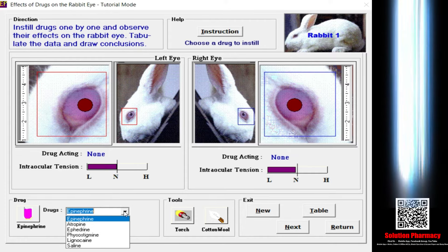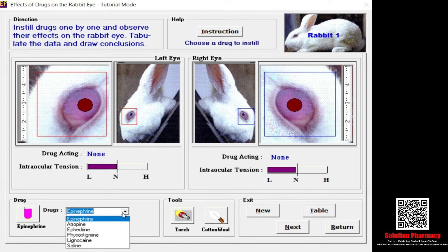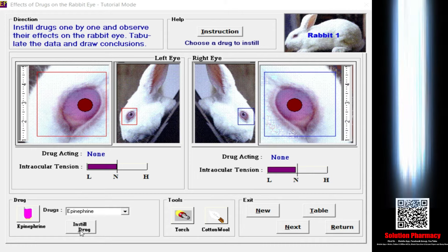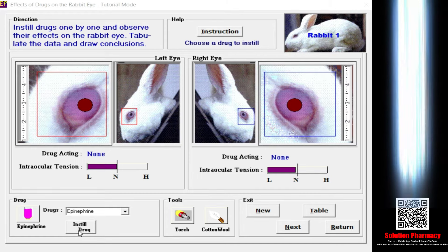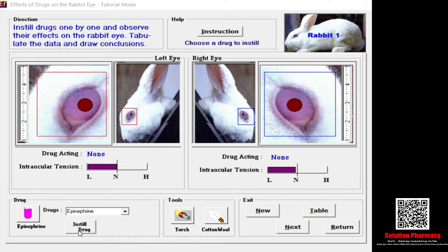You need to select one drug at a time to introduce it into one eye of the rabbit. Then you will see the option to instill the drug — select the drug, instill it, then select either the right or left eye of the rabbit. I will show you this after some time.